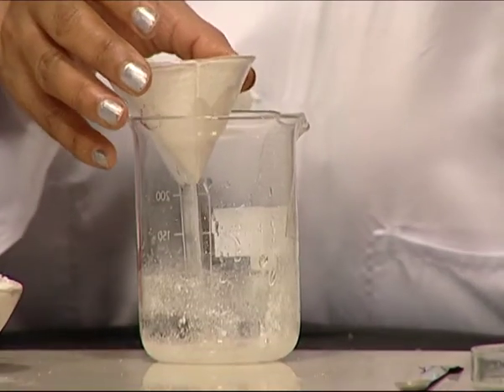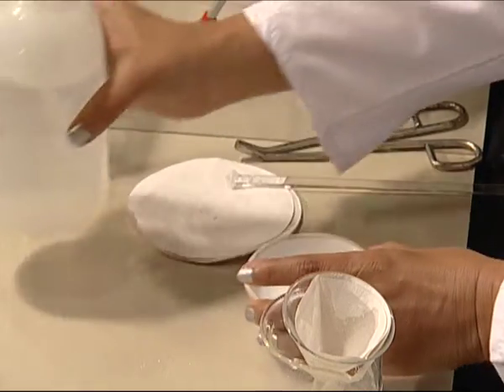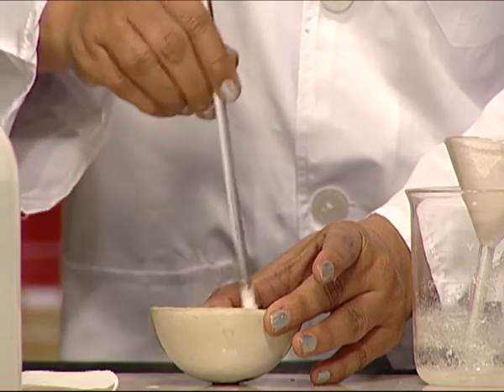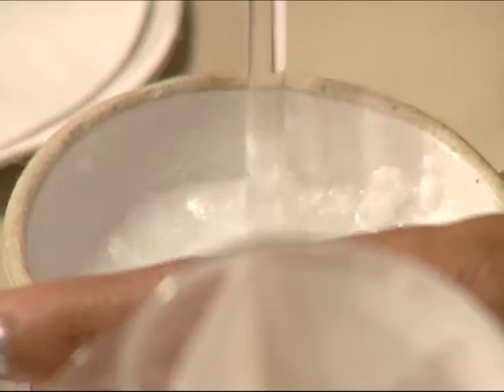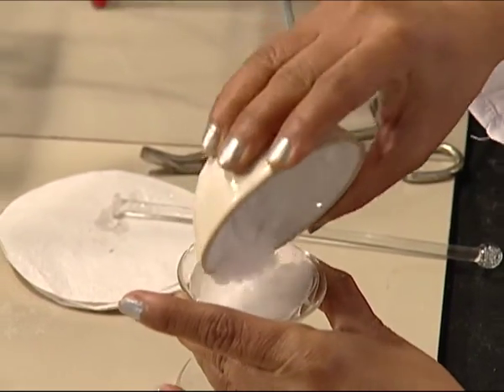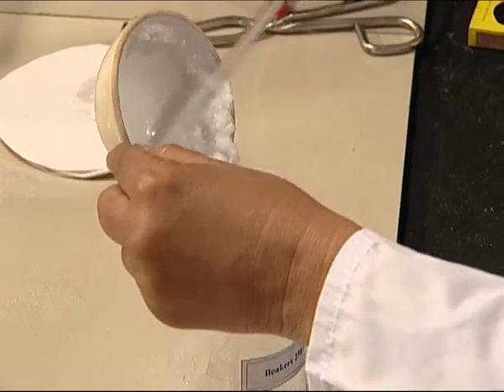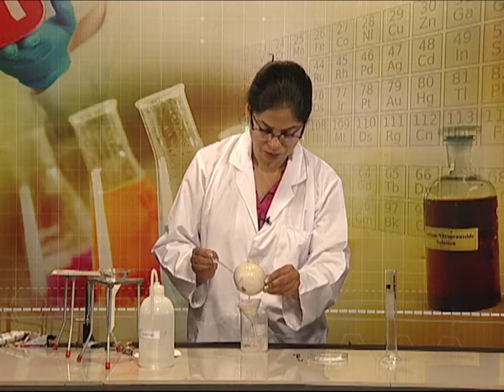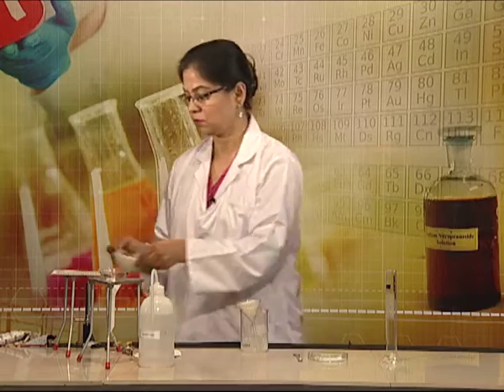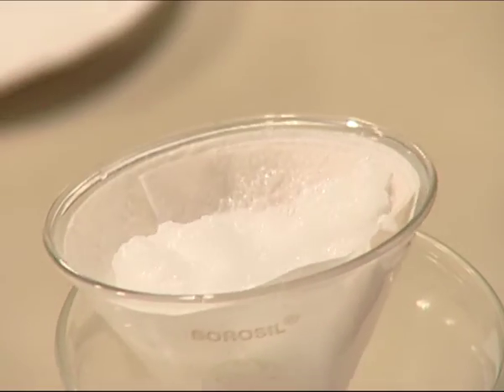Then we will wash the crystals with cold water. Now we will dry the crystals between the folds of filter paper.